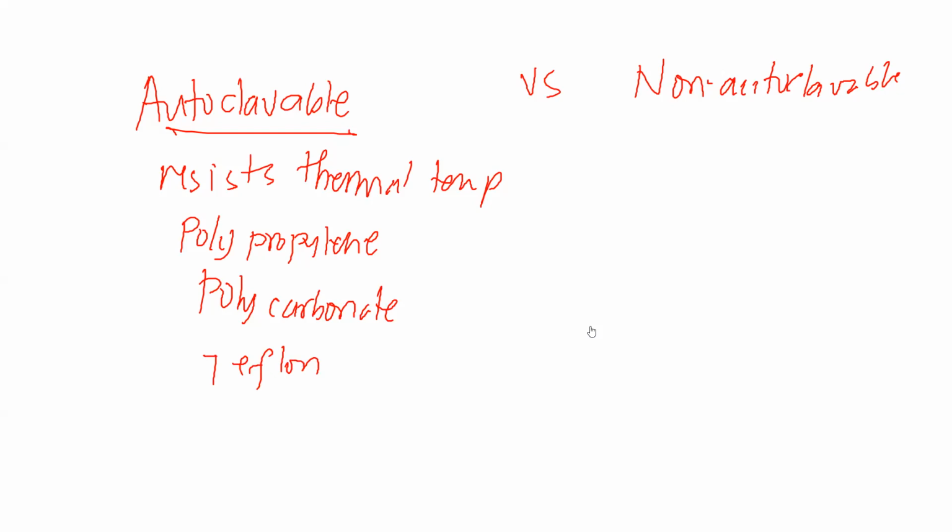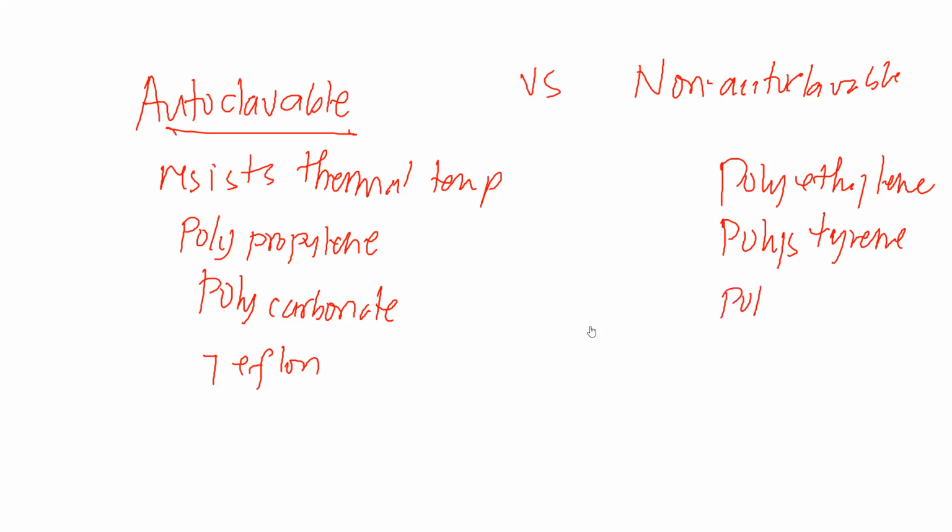How about non-autoclavable? E di, the other way around, hindi mo siya pwedeng i-autoclave. Polyethylene, ito yung example nun, yung ating polystyrene, and our polyvinyl chloride or PVC. Polyvinyl chloride, yung PVC. Okay? So that's the difference between autoclavable and non-autoclavable.